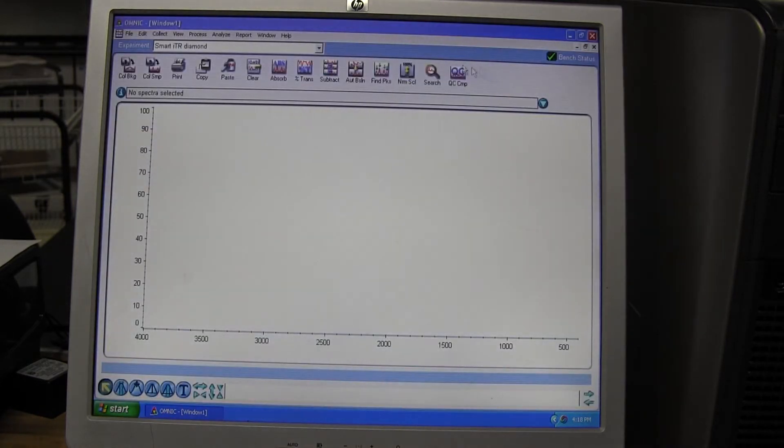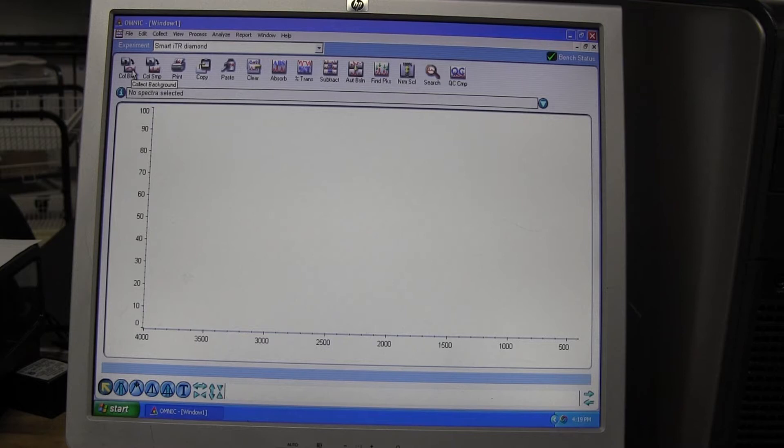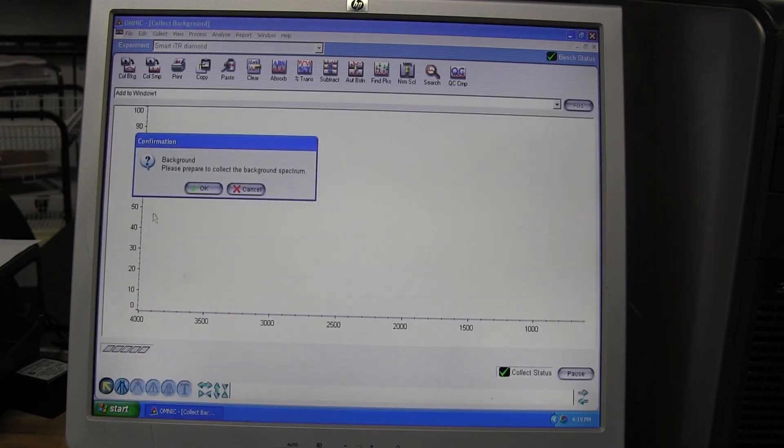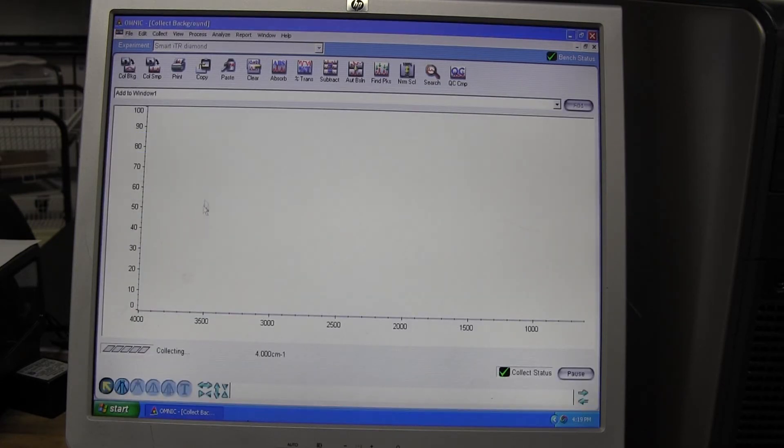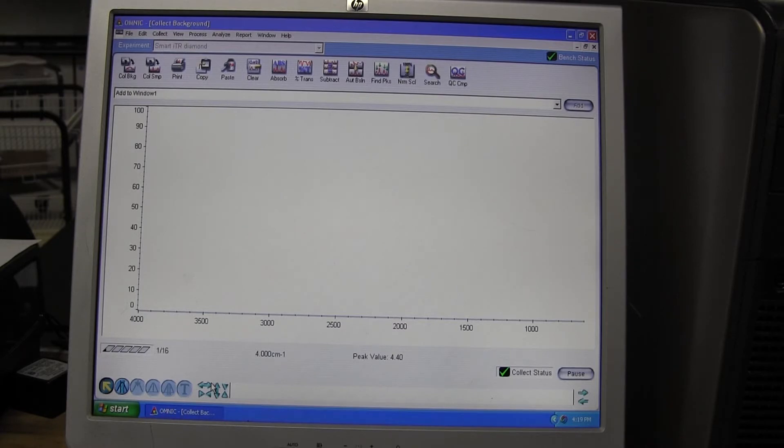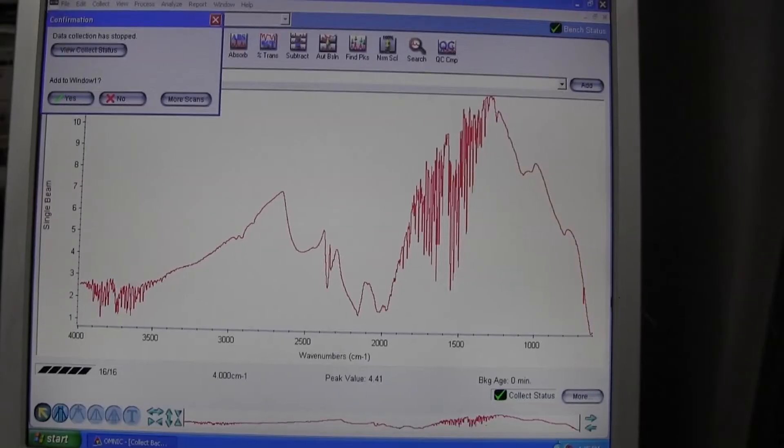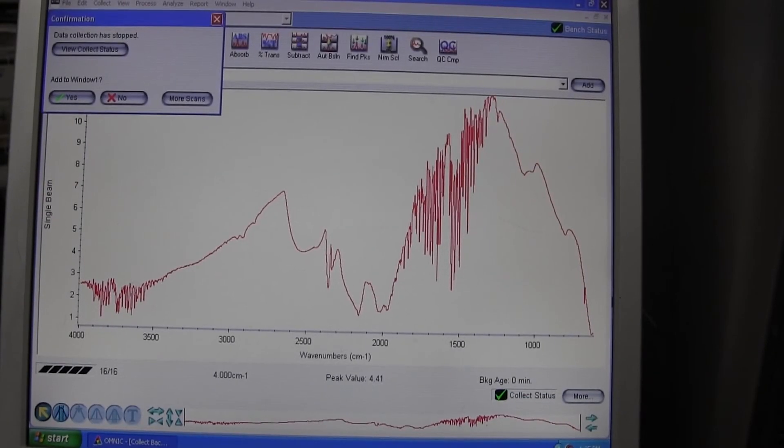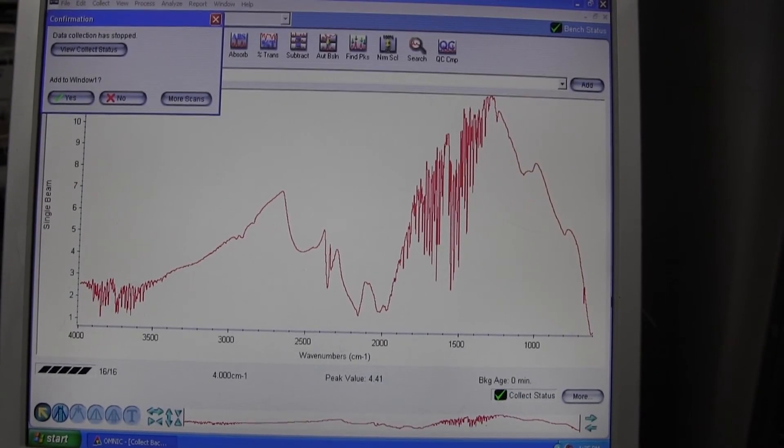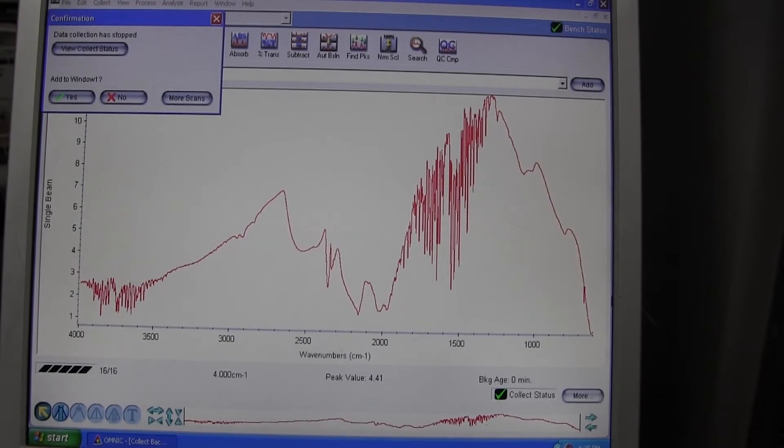You will need to collect a background before you load your sample. To do this, clean the crystal and select Collect Background from the top menu bar. Avoid touching the table while this is running. When finished, do not add the background to a new window.